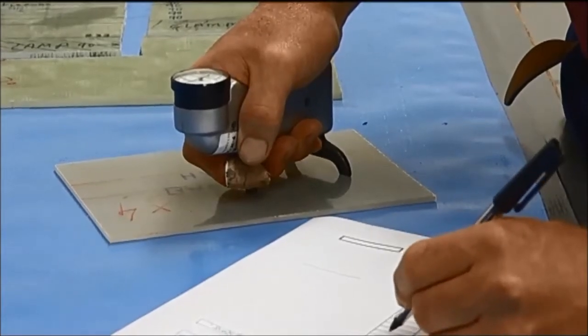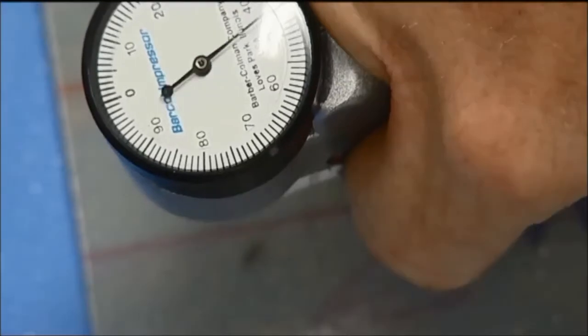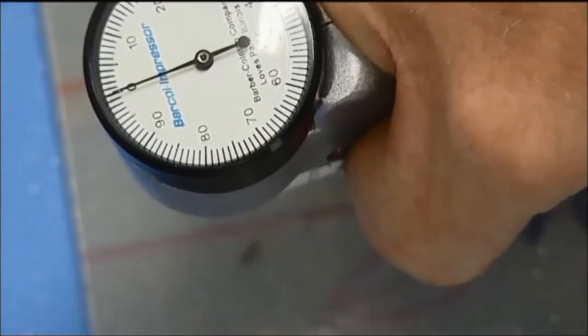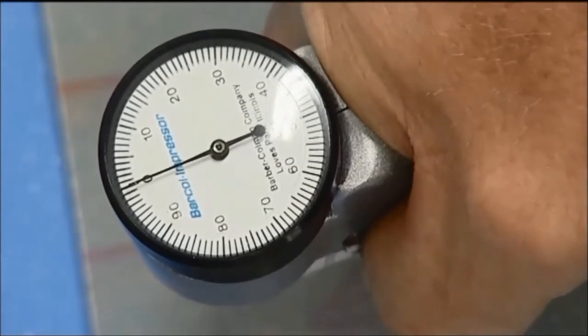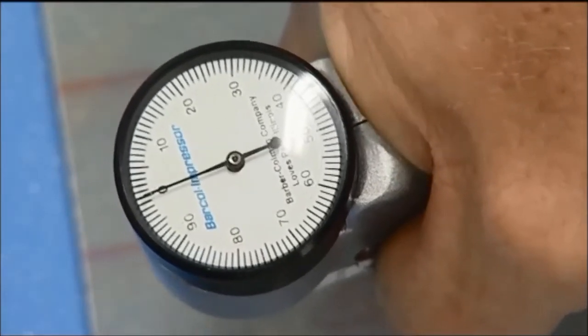The specimens are required to be a minimum thickness of one-sixteenth of an inch. They are placed under the indenter of the Barcol hardness tester and a uniform pressure is applied to the specimen until the dial indication reaches a maximum.